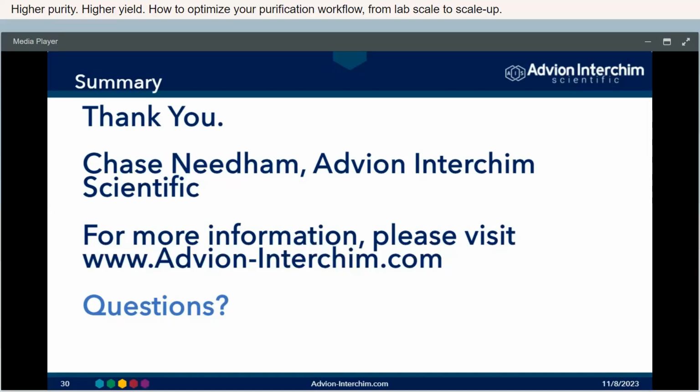Number one is that the thickness needs to be between 200 and 250 micron of silica. And this is something you can ask your manufacturer of your TLC plate, as they always have those specifications. The only reason that is a requirement is that that's the optimum thickness for the plate to have a good seal, so that you don't have any leaking from the elution head. But yeah, C18 is commonly used by our users, and there are no issues with using different types of media other than a normal virgin silica TLC plate.